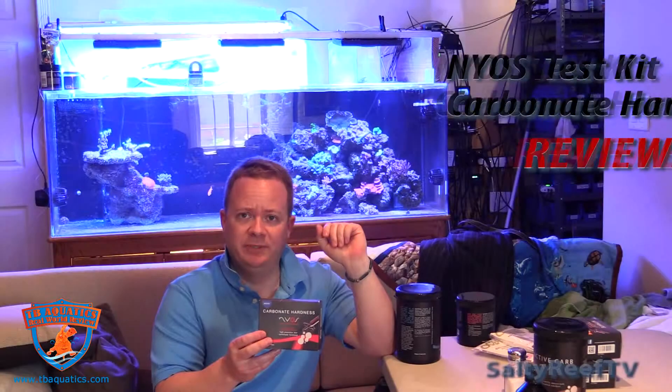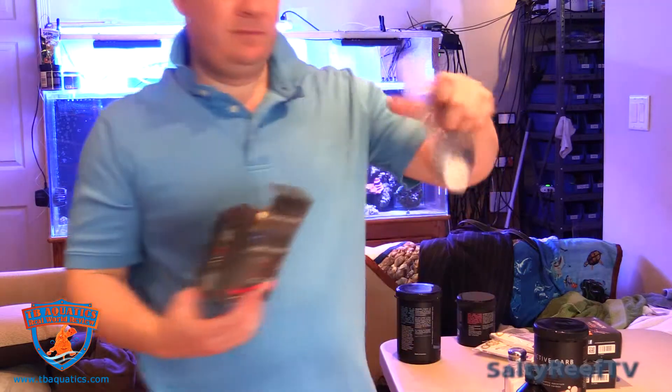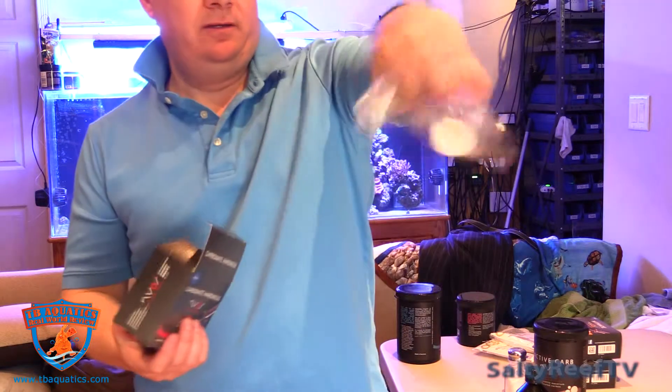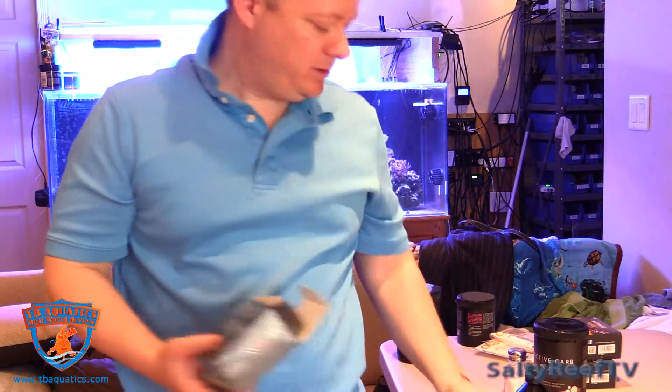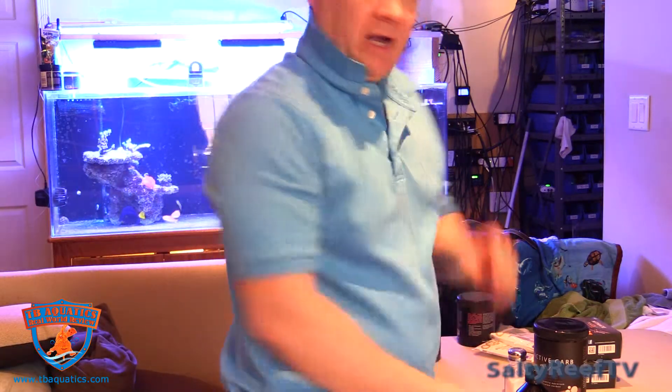Today we're trying out the Carbonate Hardness Test Kit by NYOS. It comes in a nice little bag with Reagents 1 and 2. NYOS has already done a great video on how to actually perform this test. In this video, I'm just going to give my opinion about how it stacks up against what I'm currently used to using, which is the API Test Kit.